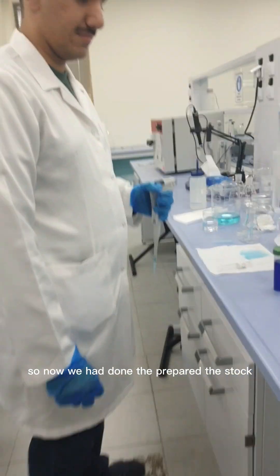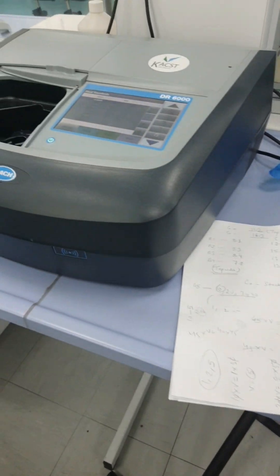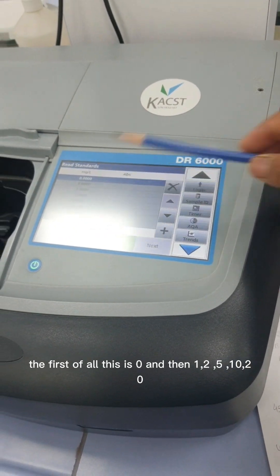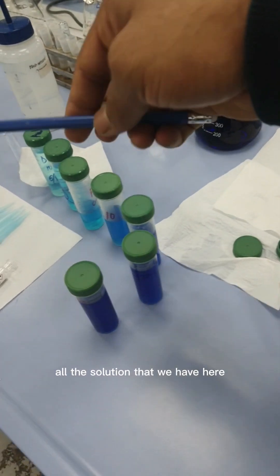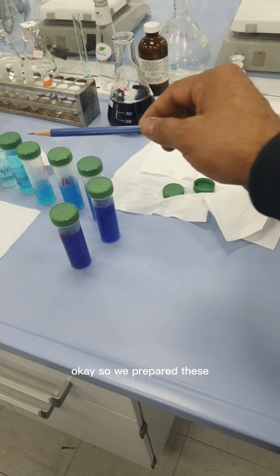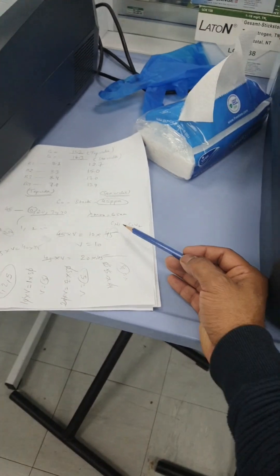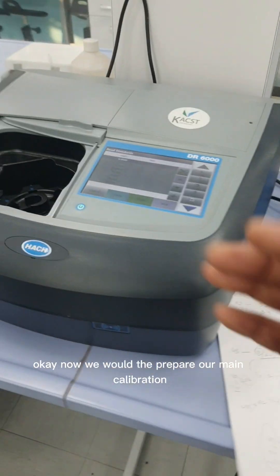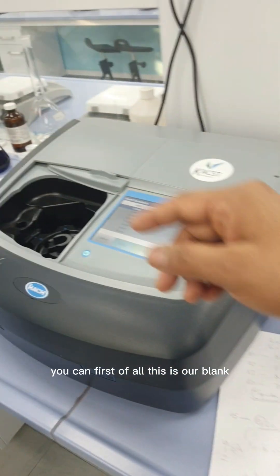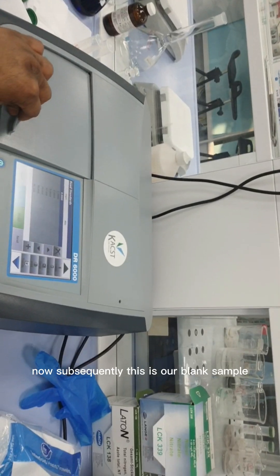We have prepared the stock solution and from it made serial dilutions. You can see we have prepared zero, 1, 2, 5, 10, and 20 ppm solutions. All lower concentrations were prepared from the main stock using the formula C1V1 = C2V2. Now for the main calibration: place the blank in the cuvette holder and press Zero.